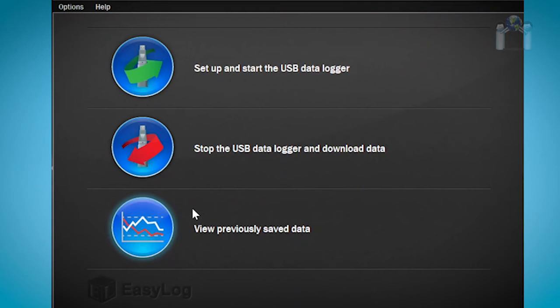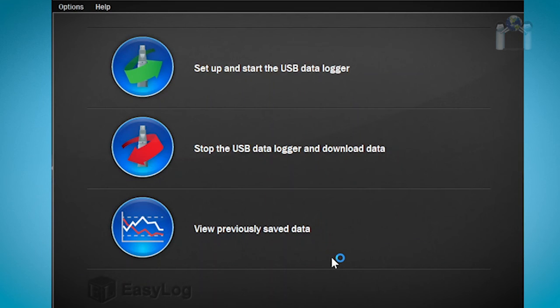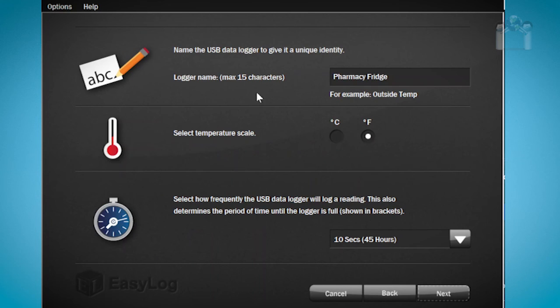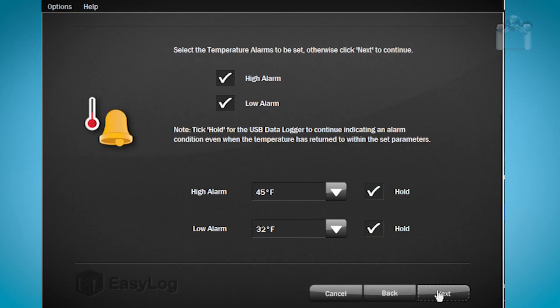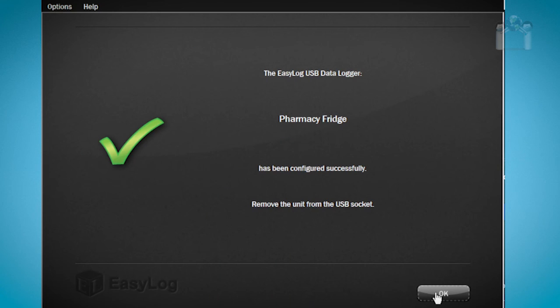You can review downloaded data any time you wish by clicking on View Previously Saved Data from the main menu. After you click the button, simply browse to where you saved your data and select the file you wish to view. After you have downloaded the data from your data logger, it will need to be reprimed in order to use it again. Just click on Setup and Start the USB Data Logger from the main menu and repeat the same procedure from the beginning of the video. You will need to go through the wizard again, but all your previous selections will remain. If you have no changes to make, simply keep clicking Next until you reach the last screen. Choose when you wish to start reading, then click Finish. Your data logger is now ready for a new reading session.